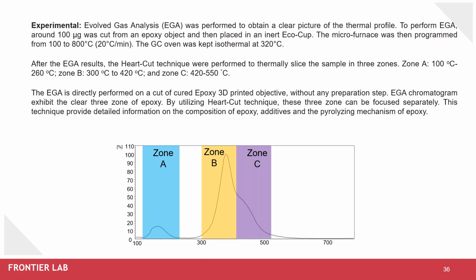So your polymers and your non-thermally active inorganics will stay inside your cup. In this case, since we're going to do a full analysis, including bulk pyrolysis, we only placed 100 micrograms. And the smaller the piece, the better in terms of homogeneity, especially if you're performing quantitative analysis.